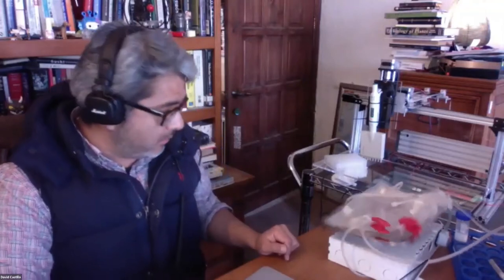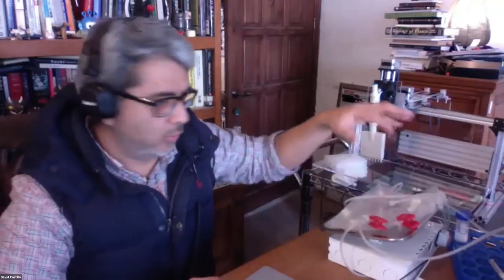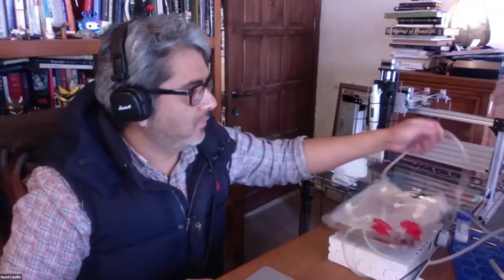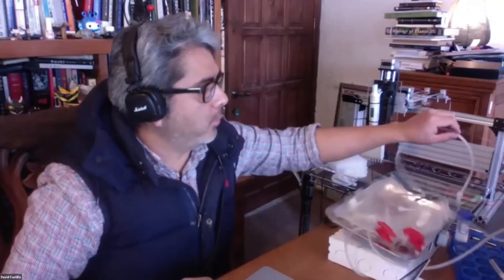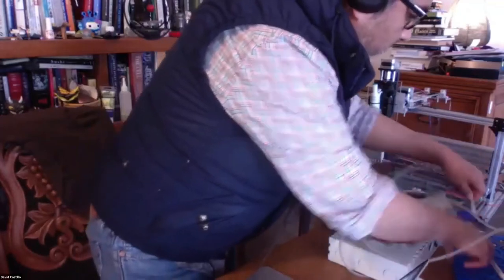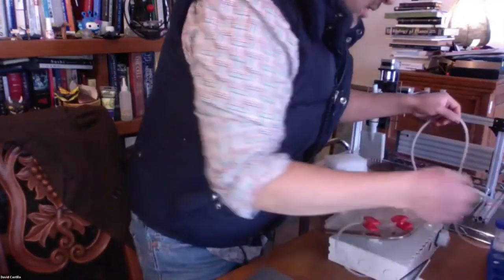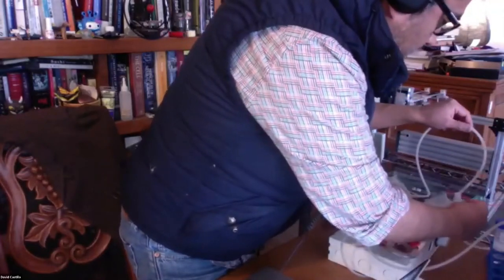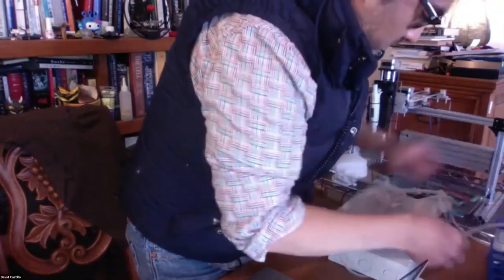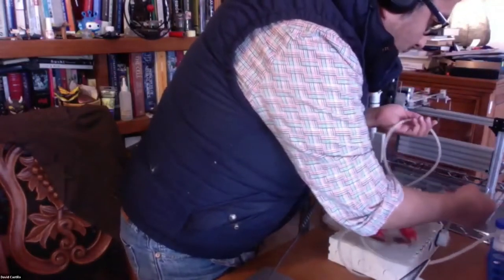And then now I'm going to enable the one that is going to be incorporating my fake media, the blue solution, into the bag. So I already have connected one port to the peristaltic pump and the other one that should be in here. Okay. I'm taking a little bit the hoses.